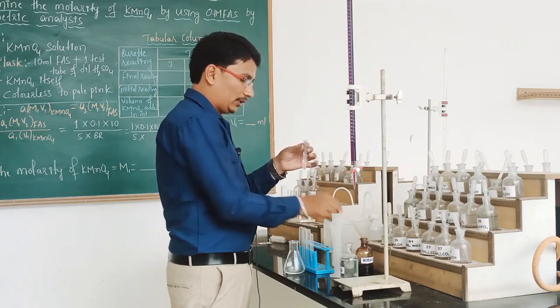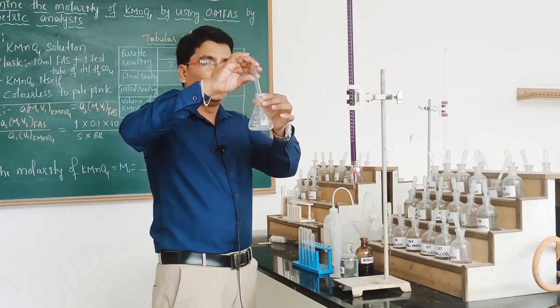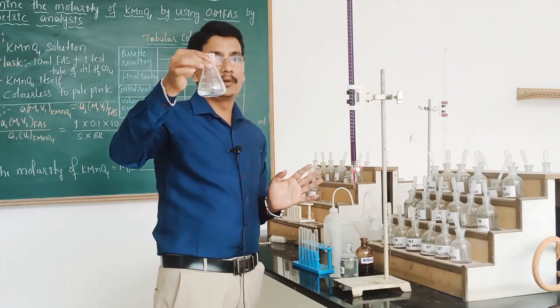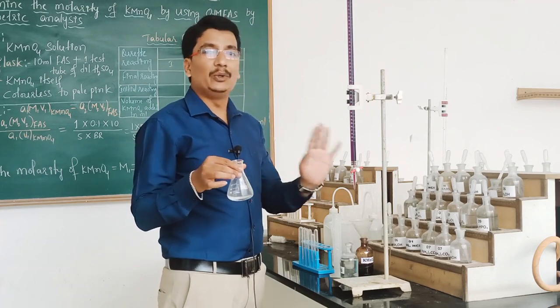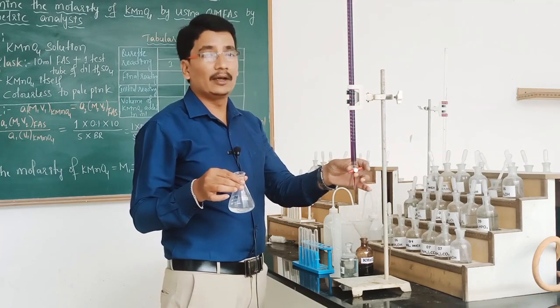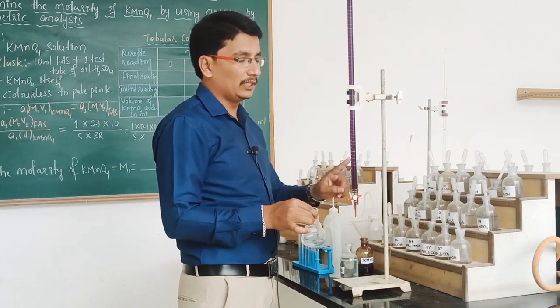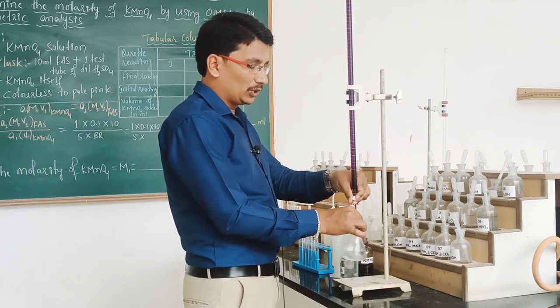ಒಂದು ಟೆಸ್ಟ್ ಟ್ಯೂಬ್ ಡೈಲ್ಯೂಟ್ H2SO4. ನಾವು ಏನು ಮಾಡ್ತಿದೀವಿ ಇವಾಗ? 10 ml FAS ಗೆ ನಾವು ಒಂದು ಟೆಸ್ಟ್ ಟ್ಯೂಬ್ ಡೈಲ್ಯೂಟ್ H2SO4 ನ ಆಡ್ ಮಾಡ್ತಿದೀವಿ. ಬಟ್ ಯಾವಾಗಲೂ ಕೂಡ ಟೈಟ್ರೇಷನ್ ಮಾಡುವಾಗ ಕೋನಿಕಲ್ ಫ್ಲಾಸ್ಕ್ ನ ಇದೇ ರೀತಿ ಹೋಲ್ಡ್ ಮಾಡಬೇಕು. We have to observe the bottom of conical flask while doing the experiment, and the knob of burette is held by using left hand. We have to stand properly, and we have to titrate against the FAS solution by using KMnO4 solution. We have to add drop by drop solution into FAS.